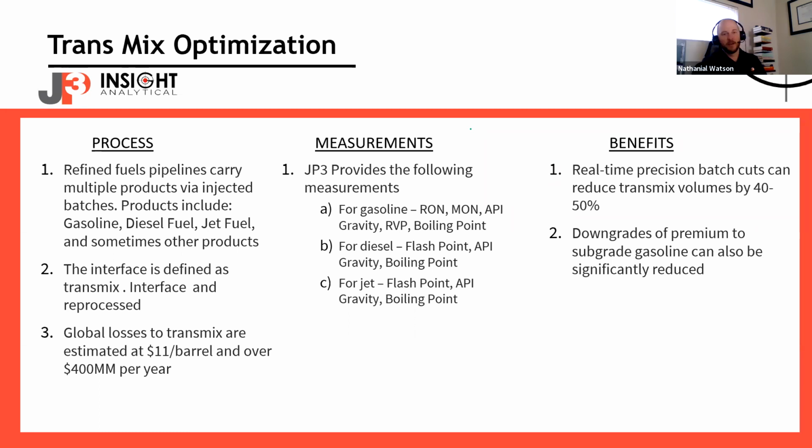Simple products, like the sample Phil just showed you of the diesel and the gasoline, trying to predict API gravity on that data, we were able to get 881 dimensional data down to one dimension that covers all the differences between those gasolines and diesels. So it's not a super complex system. Other cases, it's not that easy. That was a lot of words, but hopefully that answered the question: it varies a lot.